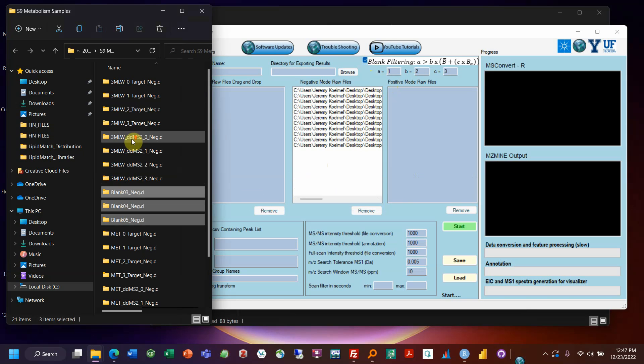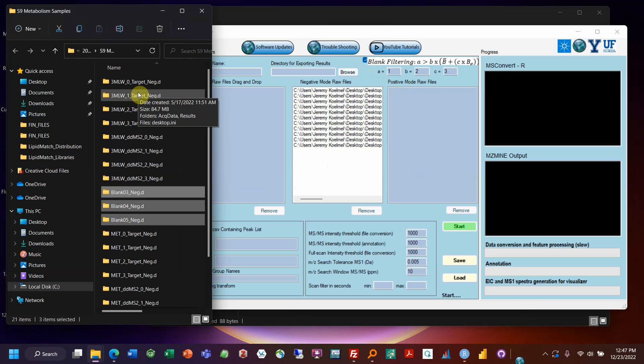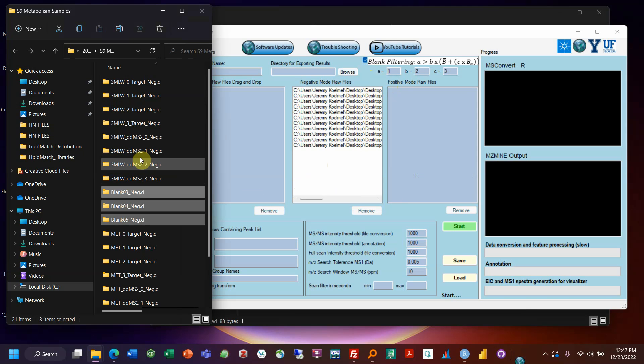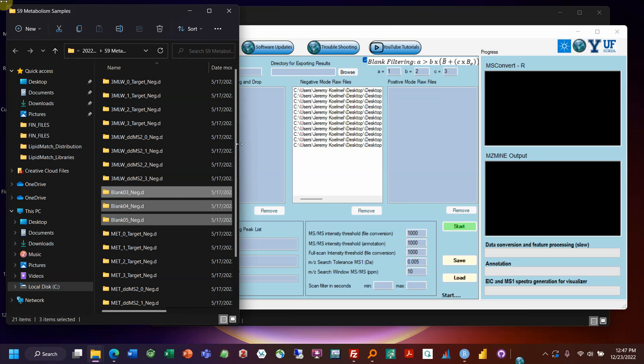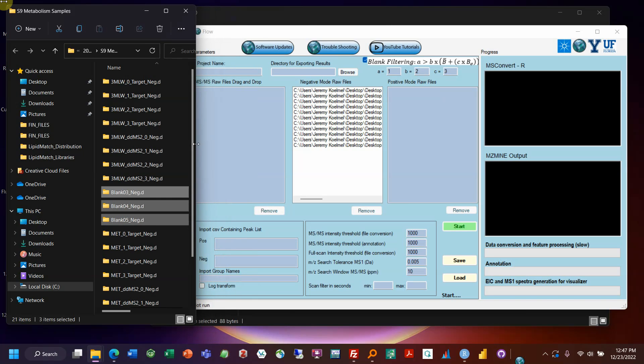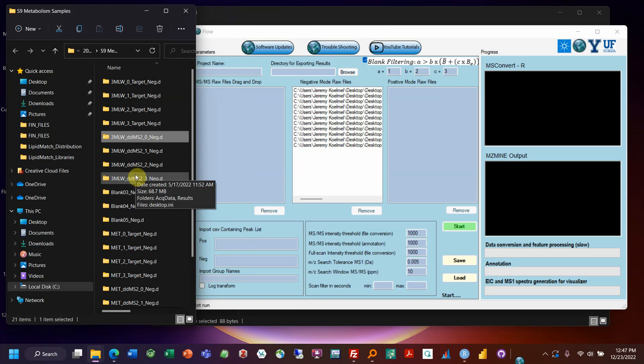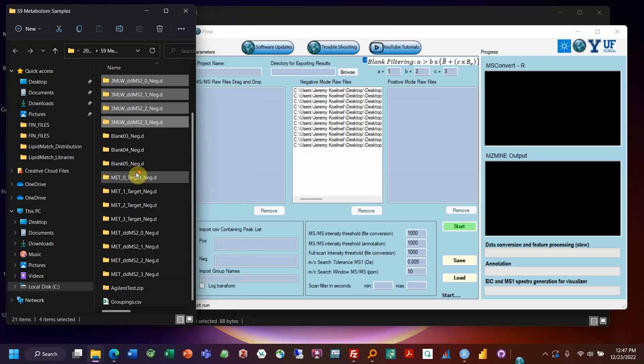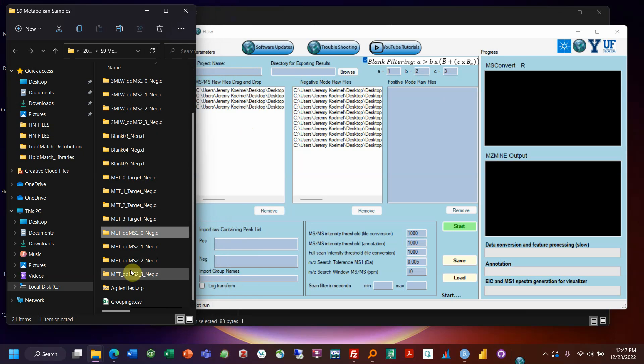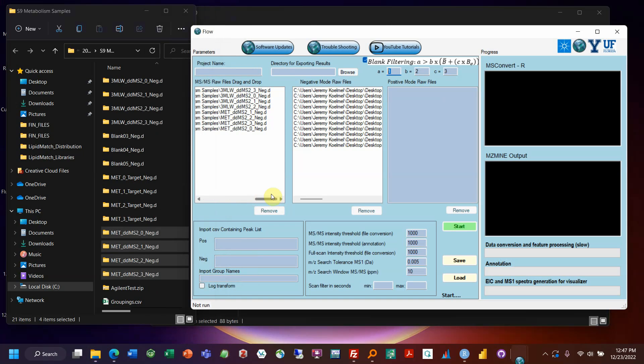Now sometimes people acquire their data-dependent data and their full scan data at the same time. In that case just copy your files over and rename them so you'll have two instances. Take a little more room on your hard drive but that's how the software works. So now we'll take our data-dependent files and you can drag them over here. And you'll want whatever MSMS files and those are all the files you'll need.